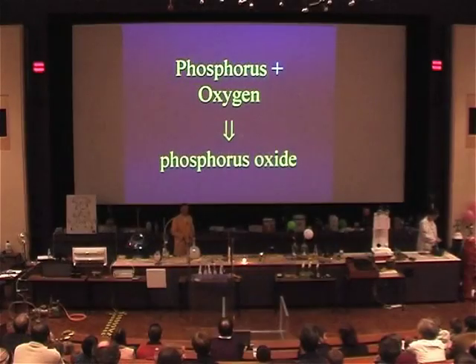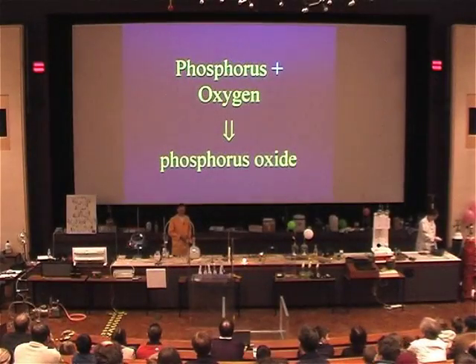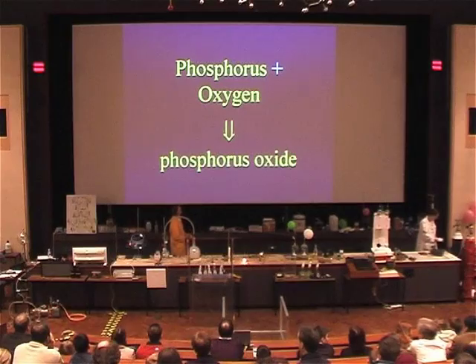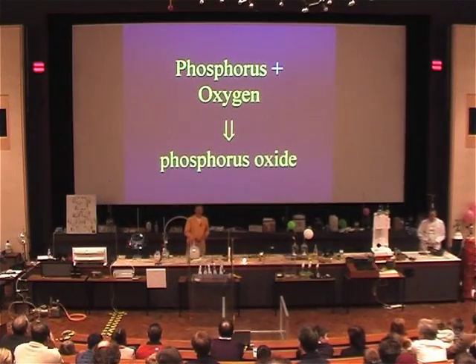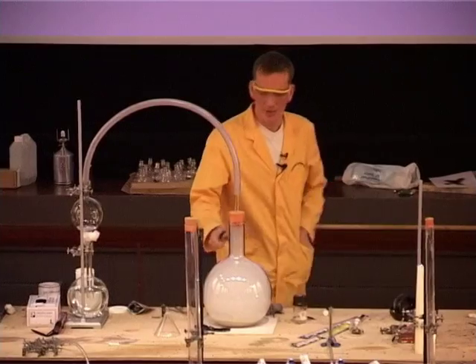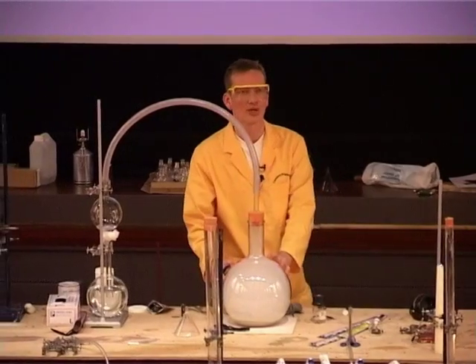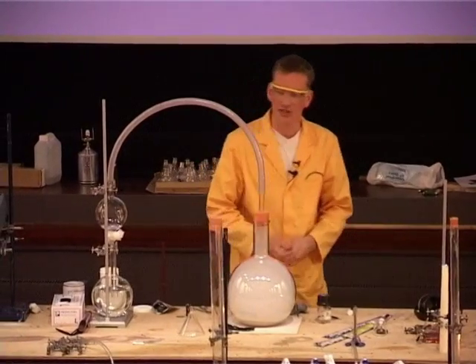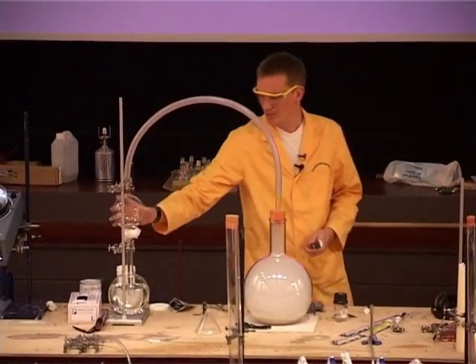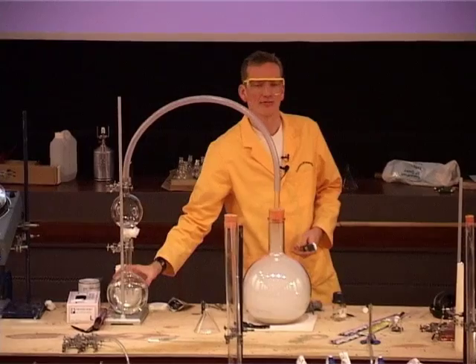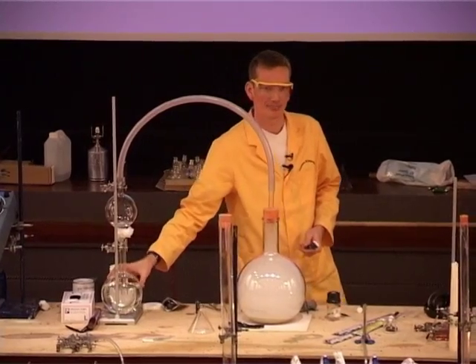Here's the chemical equation for this reaction: phosphorus plus oxygen gives phosphorus oxide. This is the smoke that we can see in here — the white smoke — coming over the tube and being absorbed in the flask here.